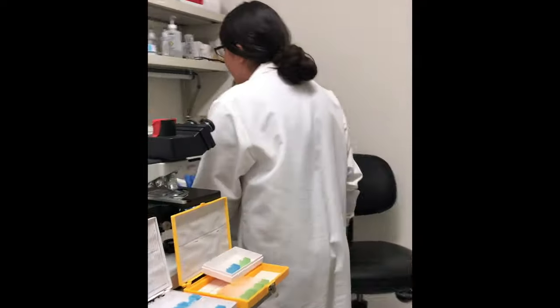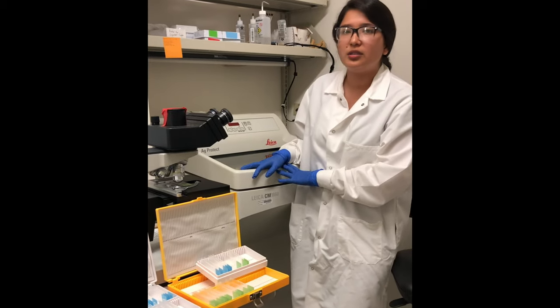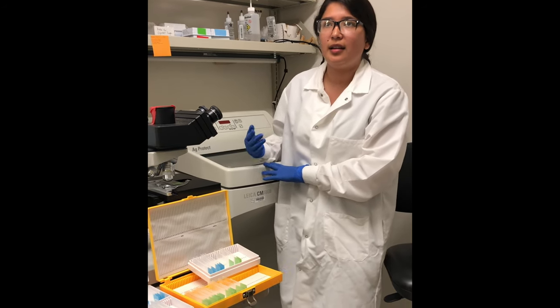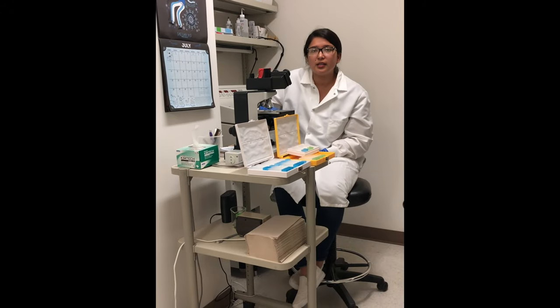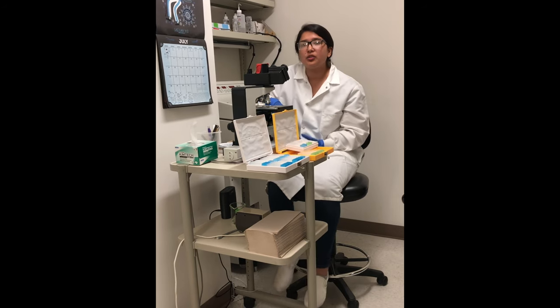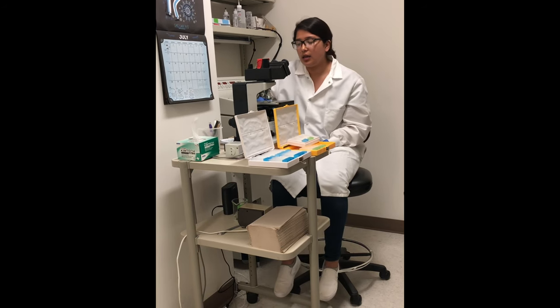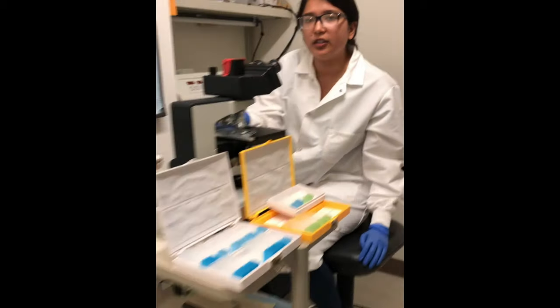The cryostat allows me to acquire sections of different embryonic ages in order to study the expression of PAX2 in the mouse optic nerve head and optic stalk. My experiment consists of characterizing the expression of PAX2 in the optic nerve head and optic stalk. PAX2 is a transcription factor which during embryonic development is involved in the formation of the eyes. If you come take a look, you can see a section I acquired of an E13.5 embryo, and you can clearly see the optic nerve head and the optic stalk.